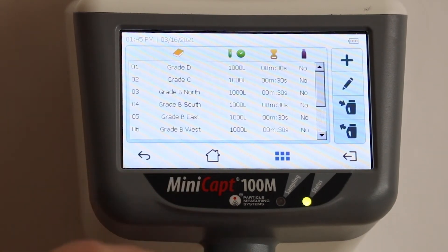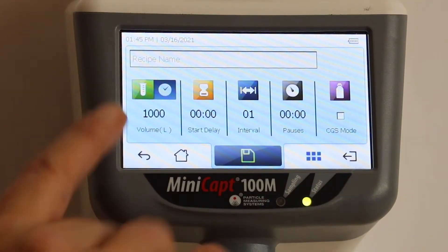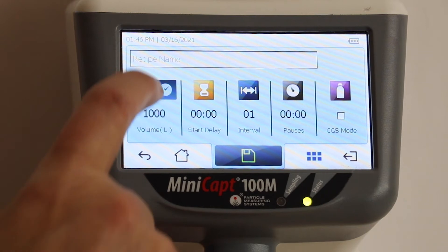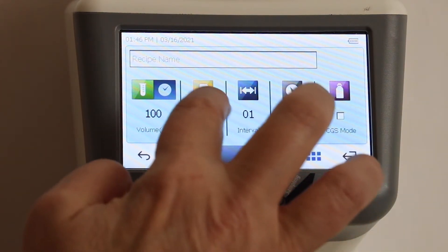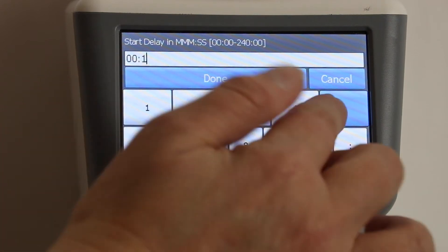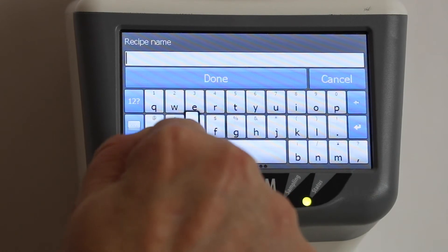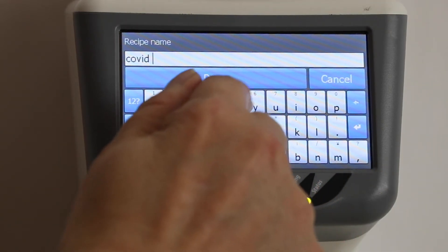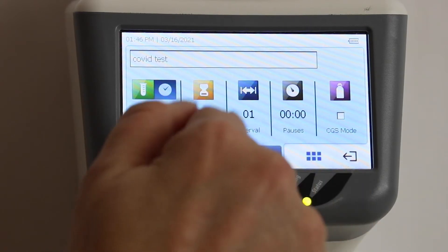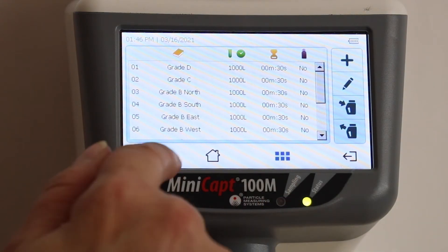With recipes you can create up to 400 locations and 50 recipes associated with those locations. I already have several recipes created, but I'll create a new one by pressing the plus sign. I'll set the volume to 100 liters for a quick sample, add a 10-second start delay, leave intervals and pauses at default, and then give the recipe a name. I'm going to call this one 'COVID Test' and save it.